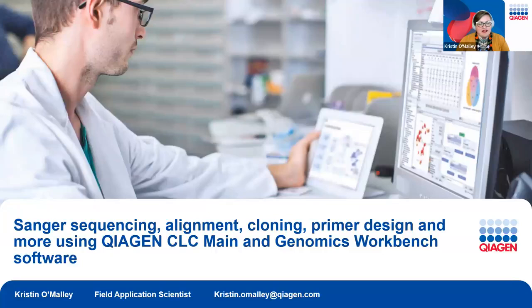So just like Araceli said, today we will be playing around with the CLC Main Workbench. We'll be doing some Sanger sequencing alignments. We'll be doing some cloning, primer design, and some in silico experimentation.